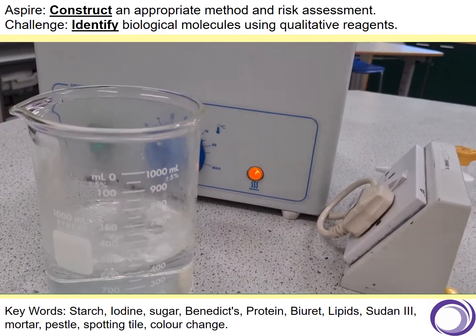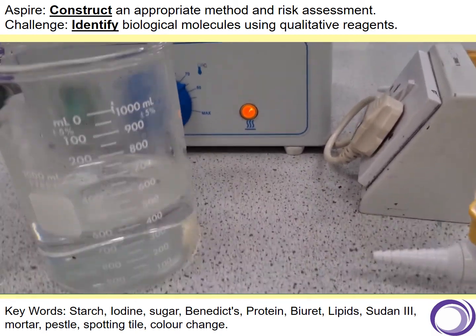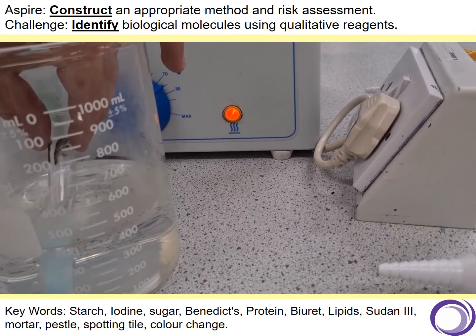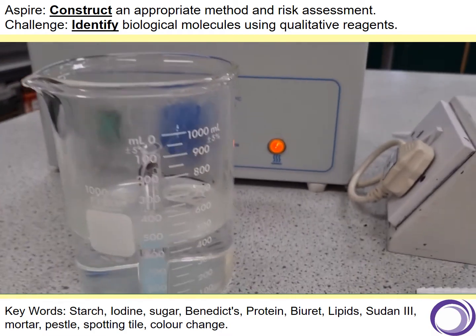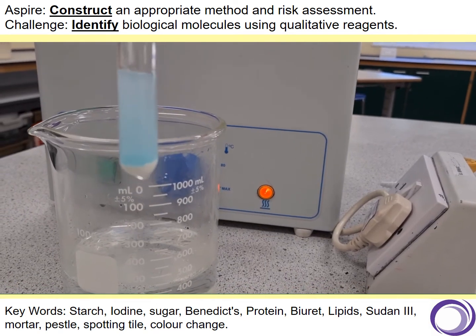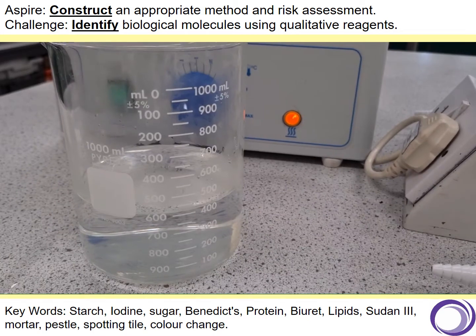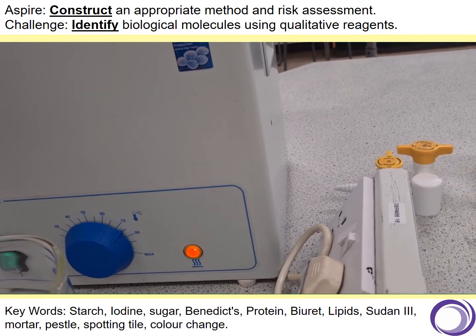Okay, so you add the water that you want, and then you can just put in your test tubes, okay, and lay them in there, making sure that they don't spill in. So now that is just laid in there, and that's a hot water bath. It's just to get the contents inside the test tube to the temperature without just adding lots and lots of hot water. So this is a hot water bath, but also you can use this piece of equipment as a hot water bath too.